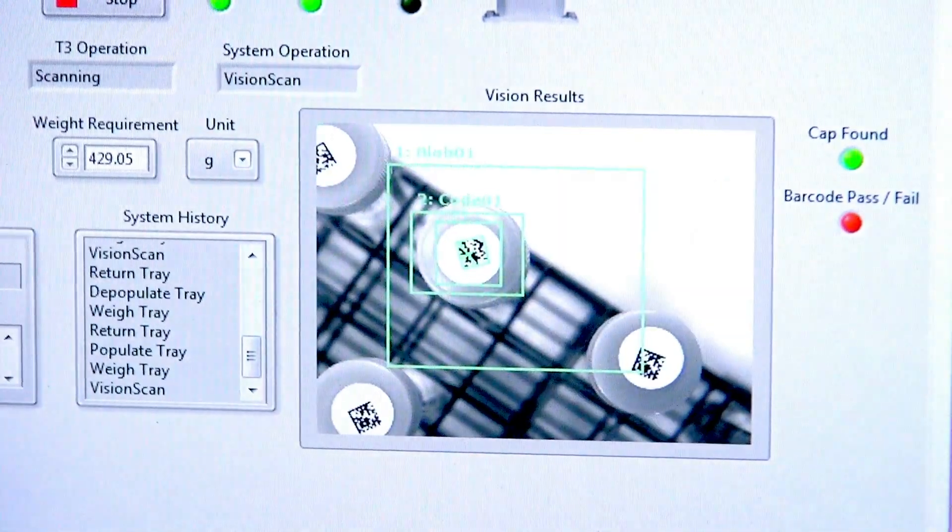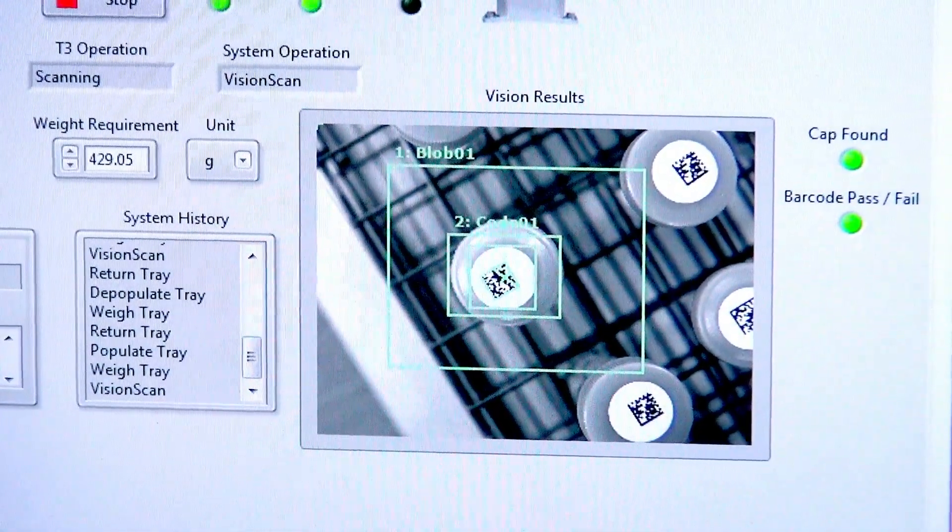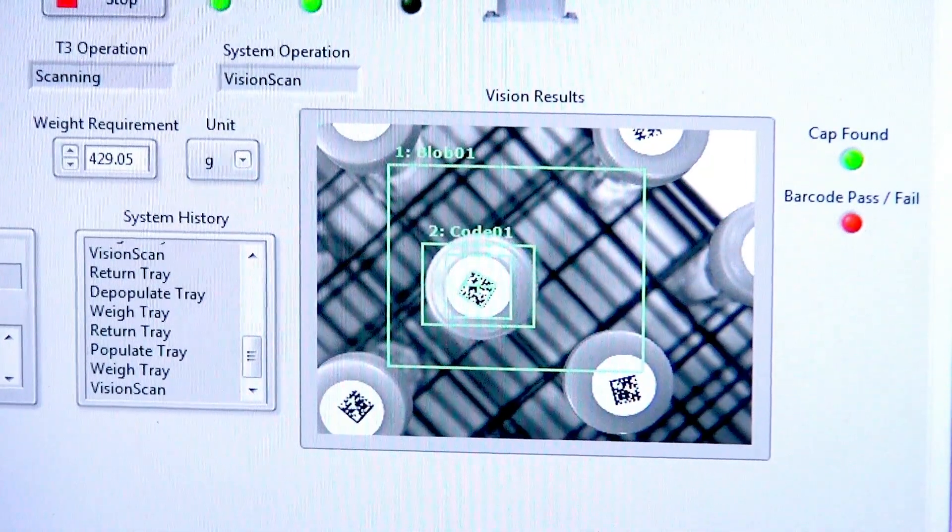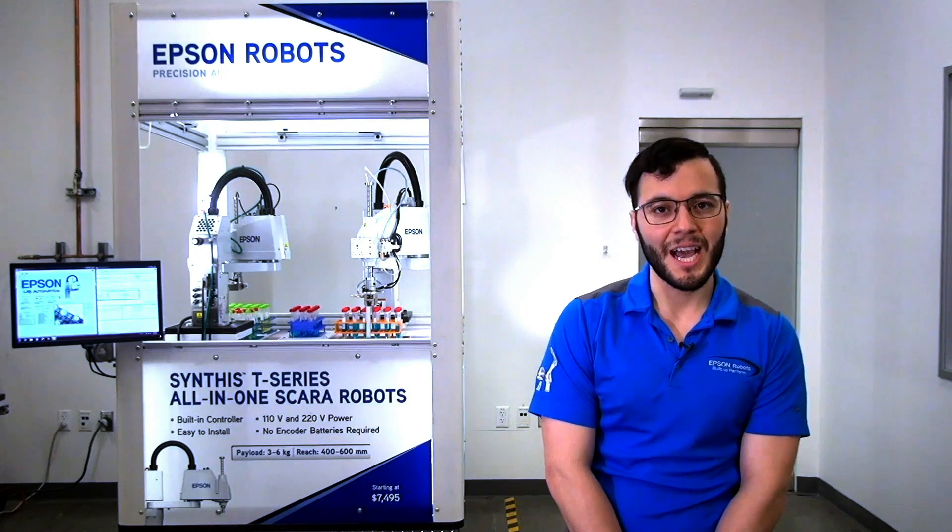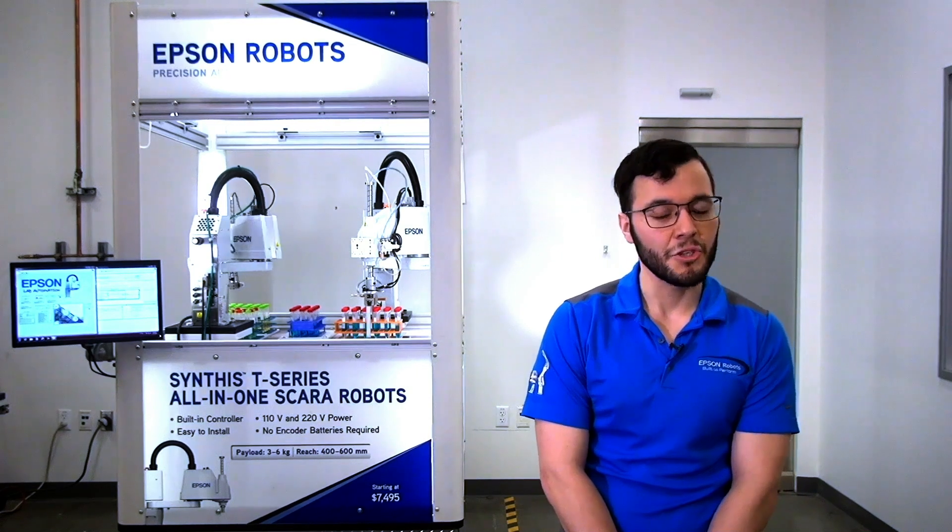The vision system is inspecting test tube caps, reading data matrix codes on the caps, and determining which tubes are good to pick. Once it finds tubes that are good to pick, it uses vision guidance to tell the robot where to go to pick the test tubes without having the gripper collide onto the head of the tubes.